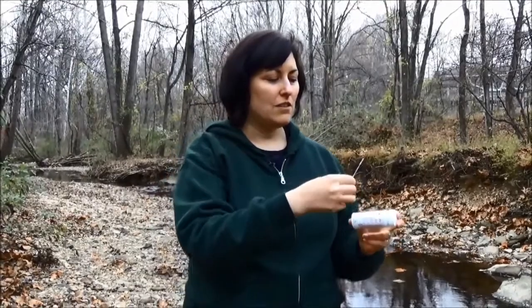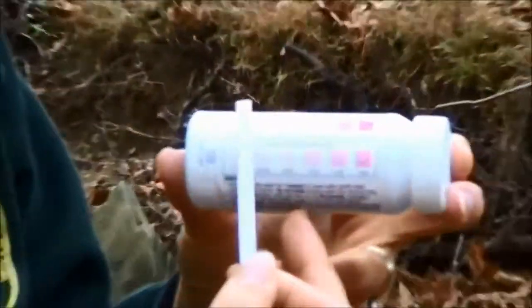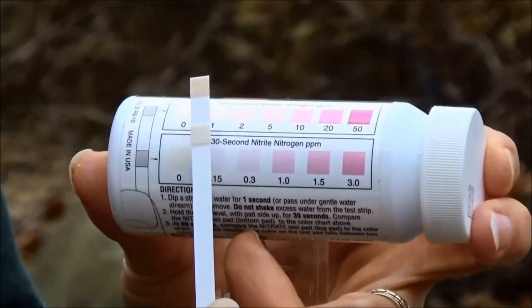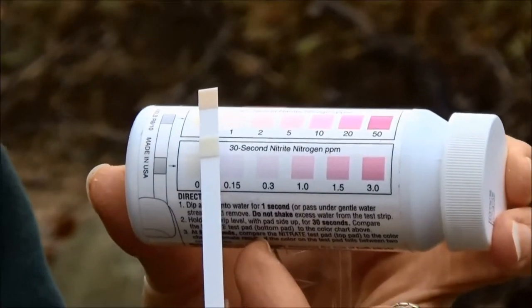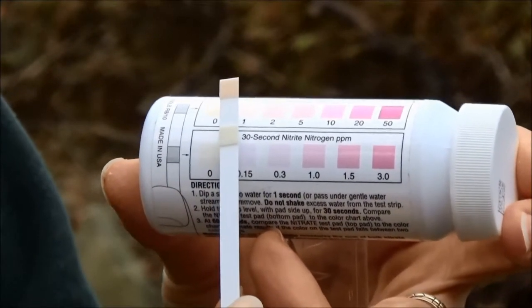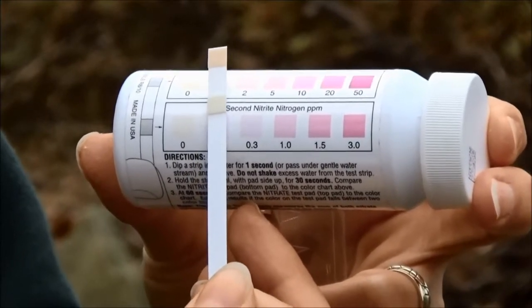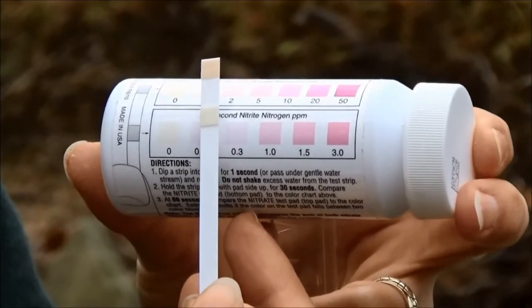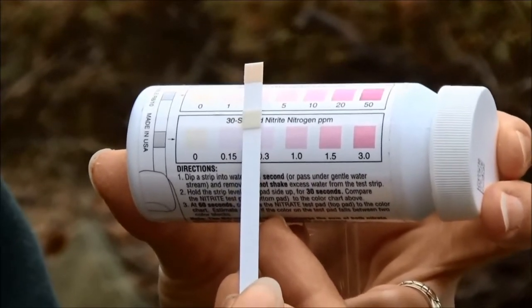With another clean sample from the stream we're going to test nitrate and nitrite. We have a test strip that has two pads on it, and we're going to dip that in the water and then hold it up to the pad on the bottle. The upper one is nitrate and the lower one is nitrite. We read the nitrite after 30 seconds and the nitrate after 60. It's important to read them at exactly the right time because the colors will keep changing and you want to make sure you get an accurate reading.